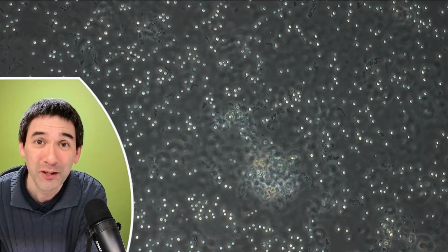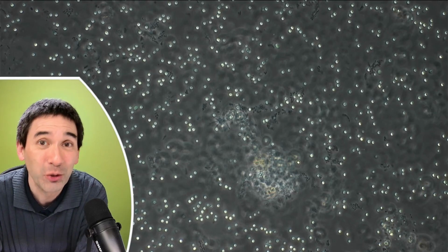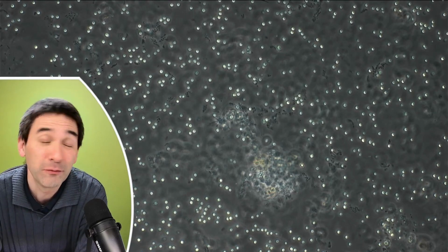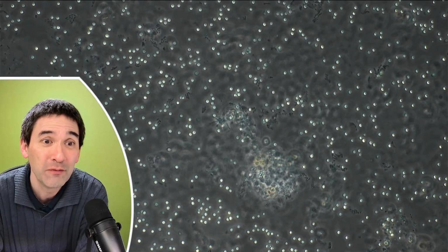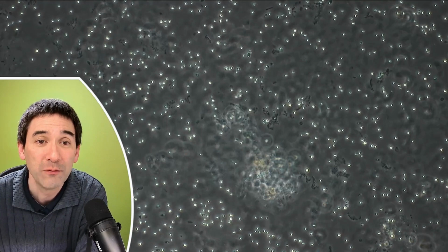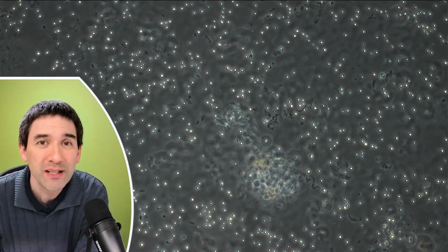And sure enough, here we are. And what you see over here is basically those white dots that you see here. These are individual cells, algae, from a water sample. And if you look very carefully, then you're going to see that some of those algae, let me focus here, they're vibrating a little bit. And this vibration, that is called Brownian motion.